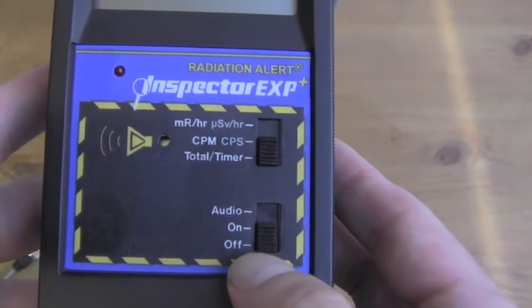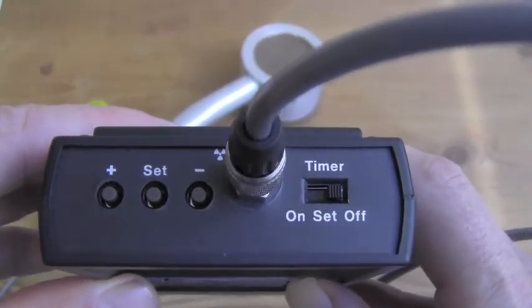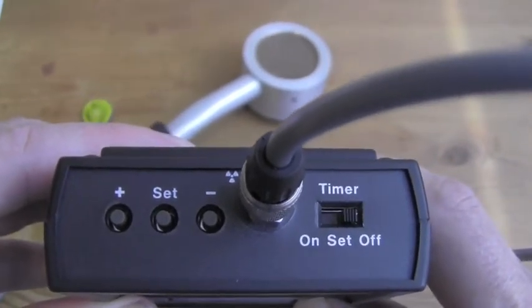This is the power switch with audio. This is the calibration input and output. And these controls on this side, they adjust the timer, response time, calibration factor, and we can change the units without recalibration.